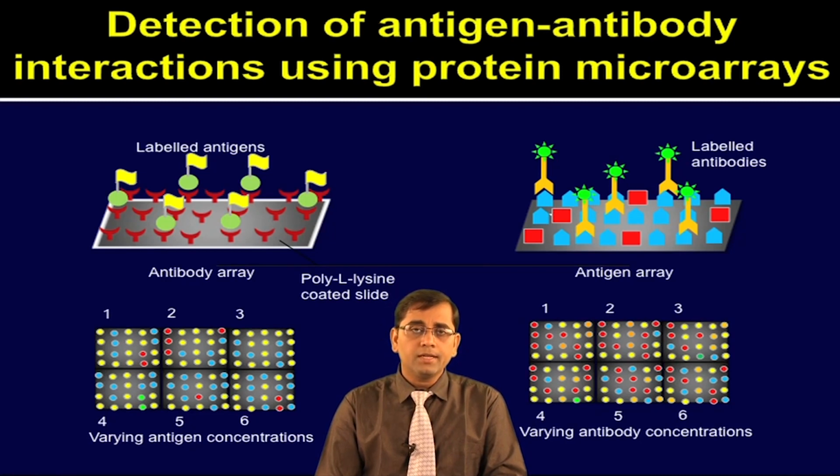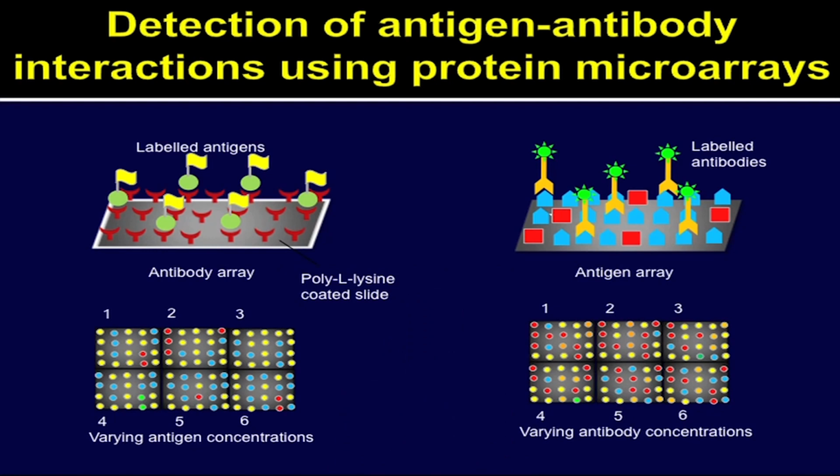The protein microarrays can provide a practical means to characterize patterns of variations, as you can see in this slide, and hundreds and thousands of proteins can be probed on these types of platforms. Let me show you the details of this study in the following animation.